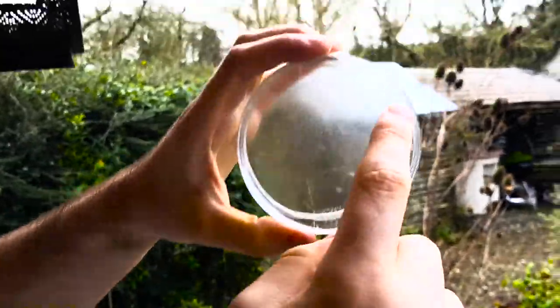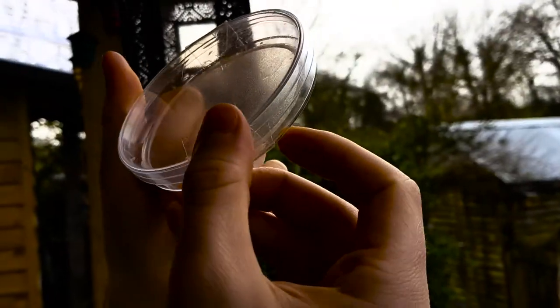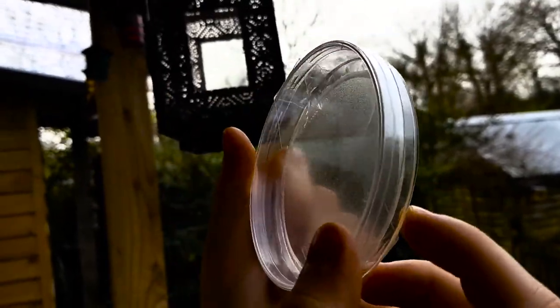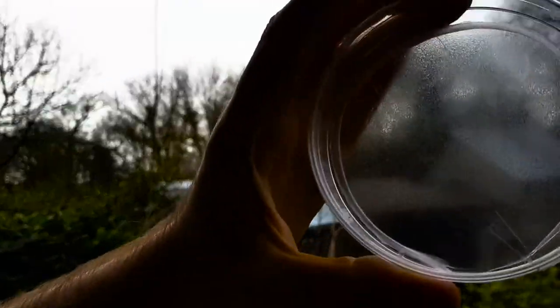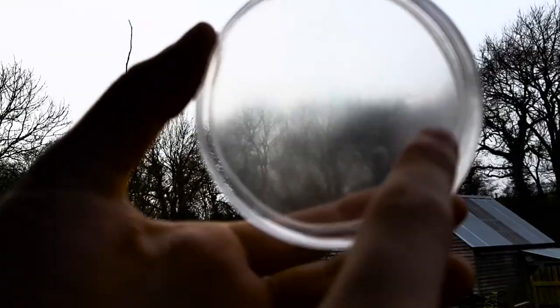So you can see the agar is pretty much dried out because we left it for so long. There's not really a lot going on there. Although, I think it's more likely that whatever was on there has just died because we've left it for too long and it's dried out. But look at this. That doesn't look very clean. There's clearly been something here.